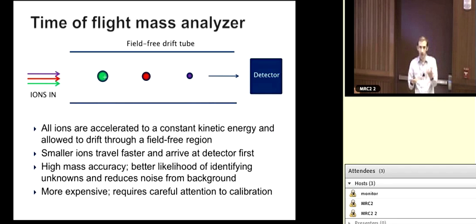If you have a lot of salt in your sample because you've submitted cell culture media to the metabolomics core and you're trying to quantitate some low-level polar metabolite, we may have a problem because the concentration of salt is so high that it may be effectively the main thing that the mass spec sees, and you can't get down to that very low concentration that you need to be able to see your metabolite of interest. So you might need to do something to your sample in order to better prepare it for mass spectrometry.